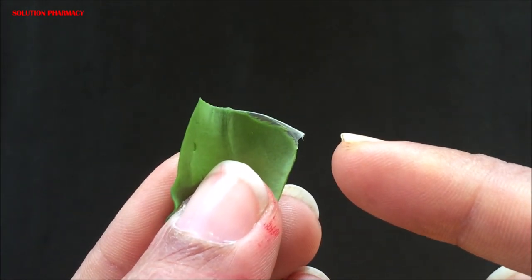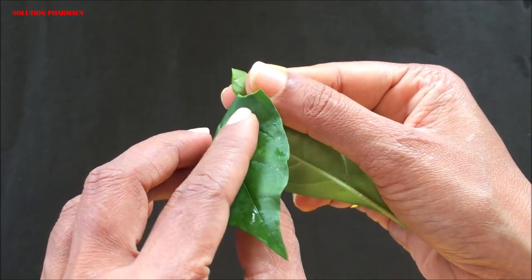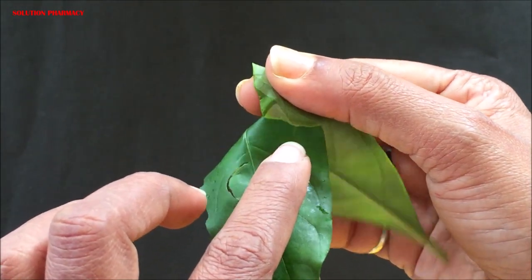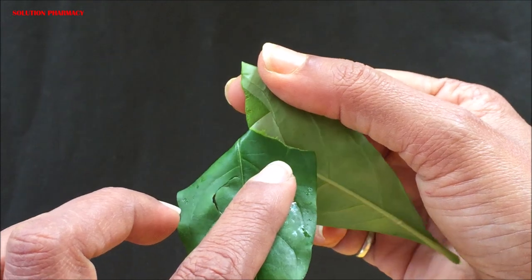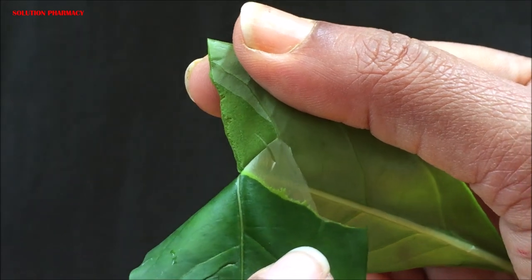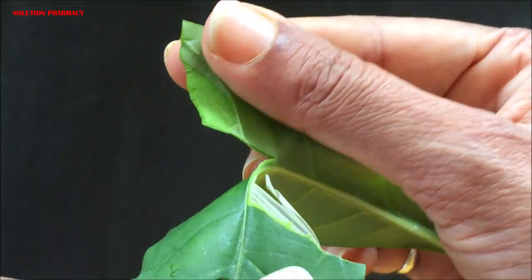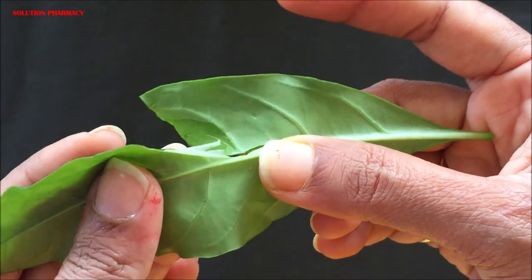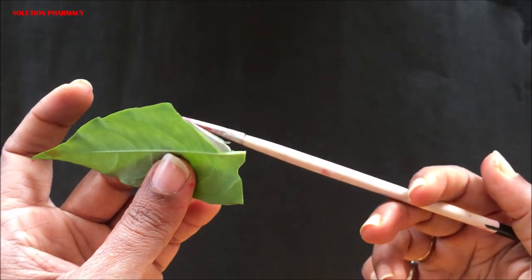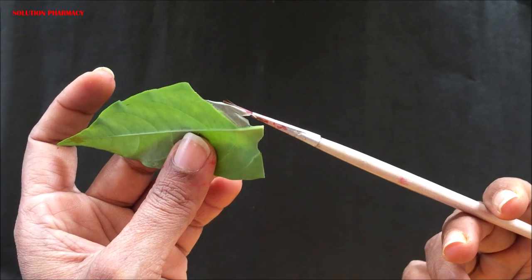We are now showing this step of separating the epidermal layer again. First tear the leaf from the margin, fold one part of the leaf, then pull the folded portion in the opposite direction to the venation slowly. You can clearly see the thin transparent layer — this is the epidermal layer — which we use to observe the stomata under the microscope.